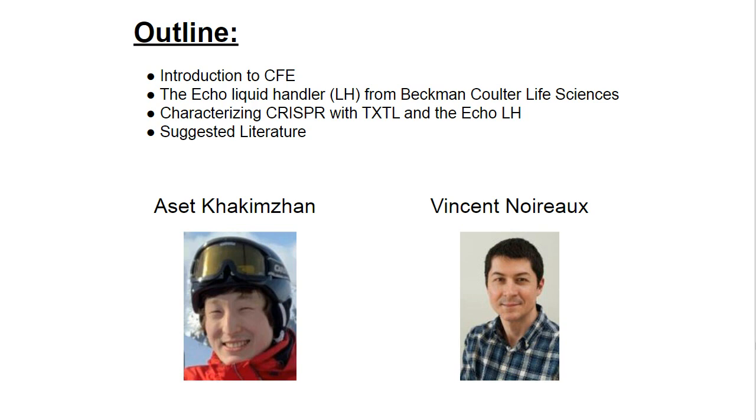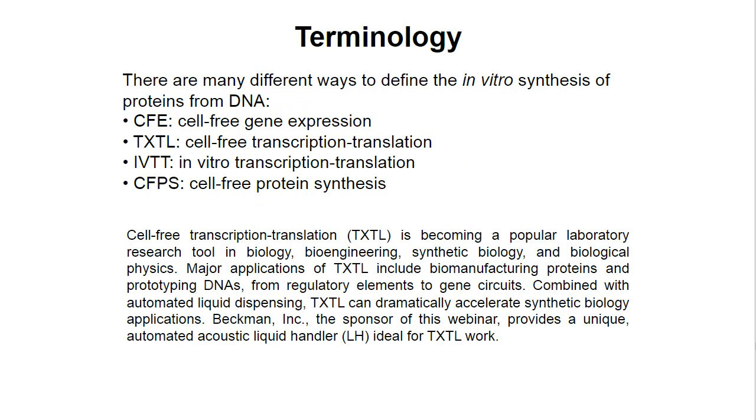Let me start with some terminology. There are many different ways to define the in vitro synthesis of proteins from DNA: CFE for cell-free gene expression, TXTL for cell-free transcription translation, IVTT for in vitro transcription translation, CFPS for cell-free protein synthesis. As you will see in this webinar, cell-free transcription translation has become a popular laboratory research tool in biology, bioengineering, synthetic biology, and biological physics.